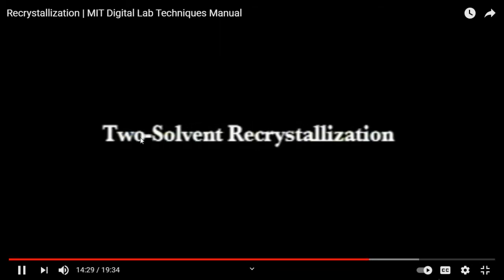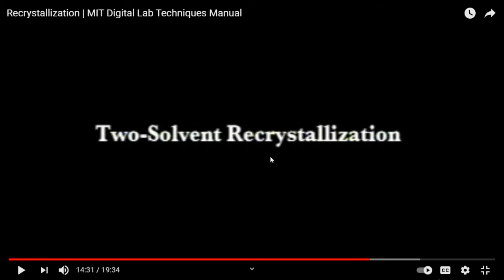They're going to be doing a two-solvent system. Okay, I'm just going to play it along. I'm not going to pause and explain because we're not doing it at your college, but just listen to them.